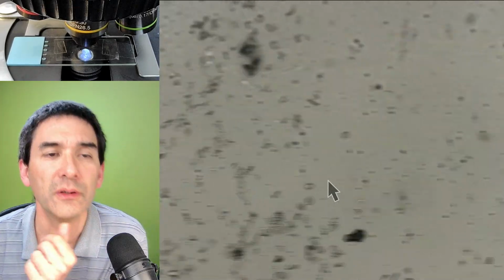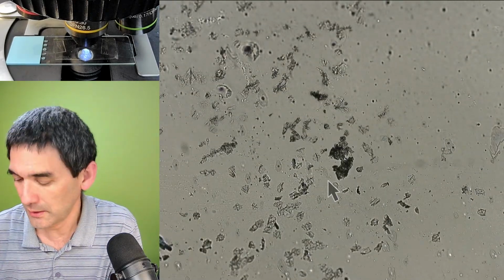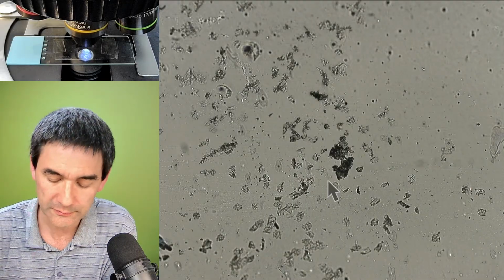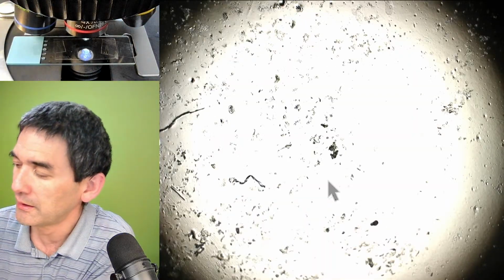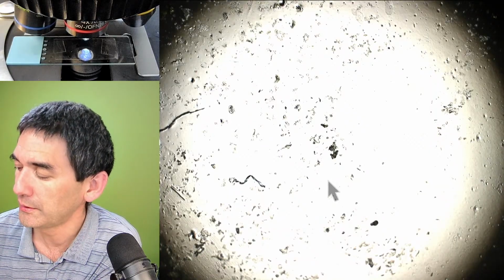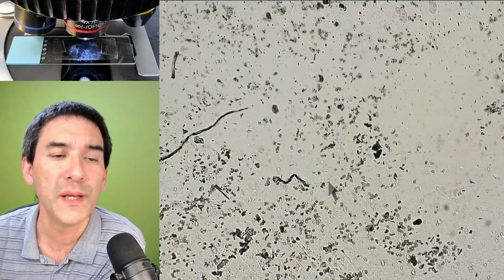So let's do the following. Let's add a little bit of oil. I'm just going to take my pipette. And I'm going to go down with the magnification a little bit so that I have a larger place to work with. You see how messy everything looks.